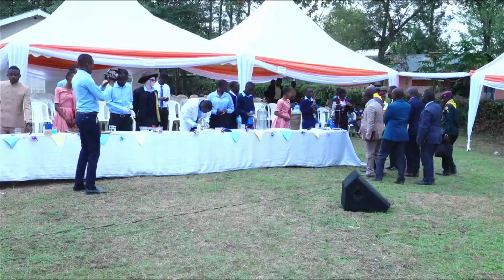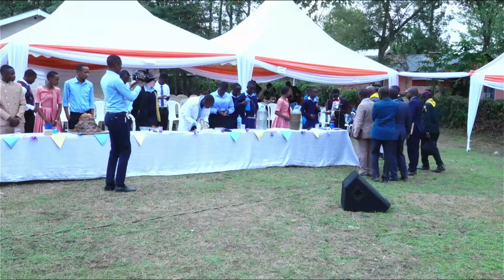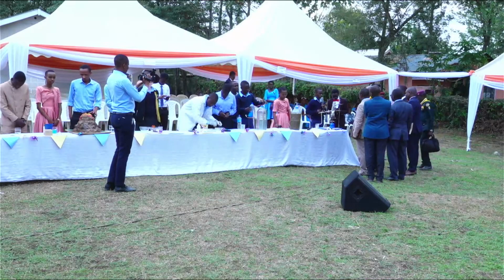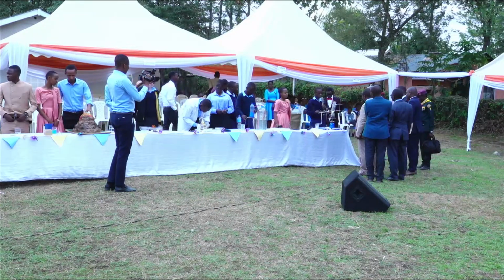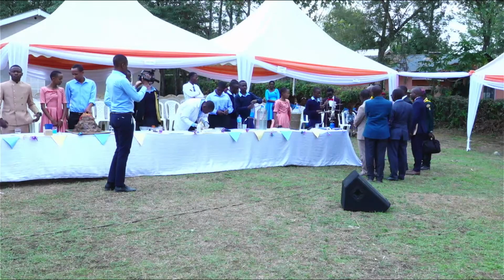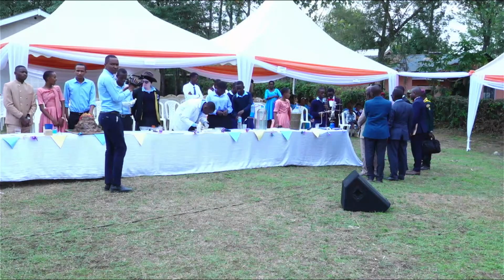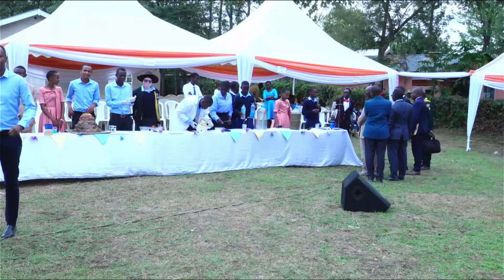Dear Honorable Guest of Honor, you're welcome to Tanzania Adventist Secondary School, and this is the chemistry department. In front of you, I am Reward Elias. I'm a Form 1B student, and today we are going to demonstrate the scientific technique which is used to separate mixtures, and it is known as simple distillation. I hope you all want to know what is simple distillation.